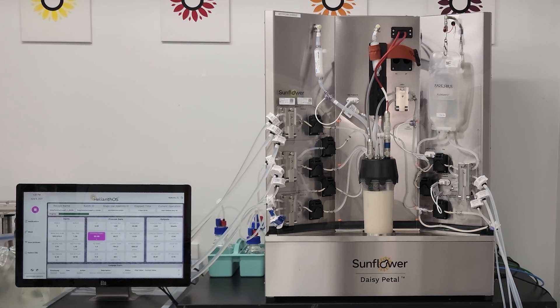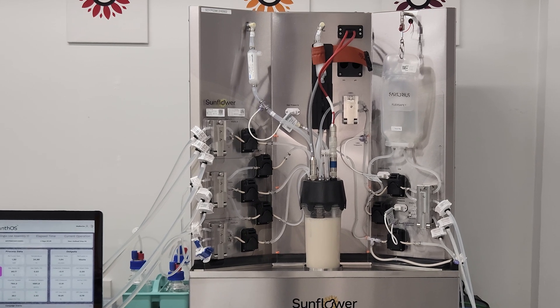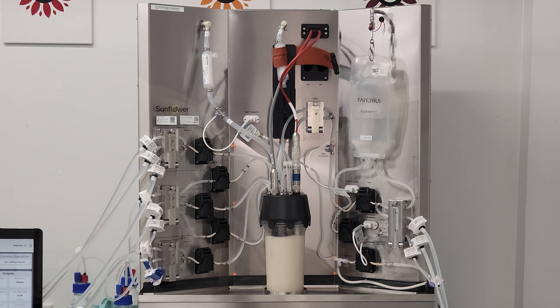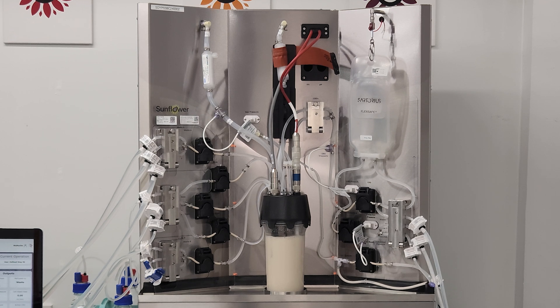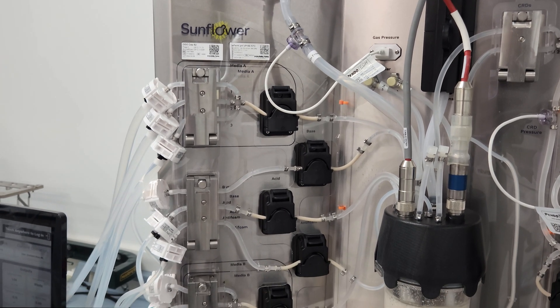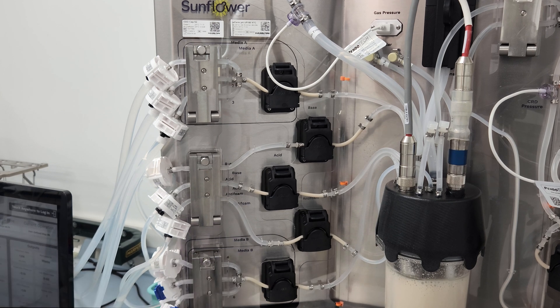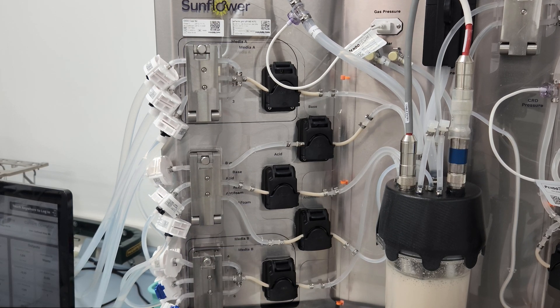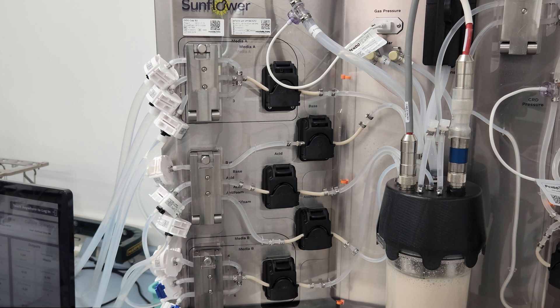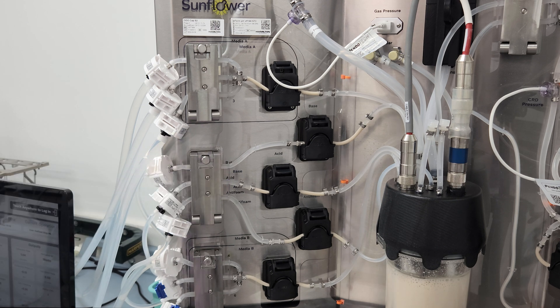In this introduction, we'll walk through the Daisy Petal system hardware with a single-use assembly already installed and a campaign in progress to demonstrate the operation of the different components. As you can see, the system has three panels. On the left panel, you will find all of the instrumentation and connections for materials flowing into the bioreactor. The top and bottom peristaltic pumps are dedicated to delivering culture media to the bioreactor vessel, each with three automated valves controlling up to six different media to accommodate different feeding strategies.